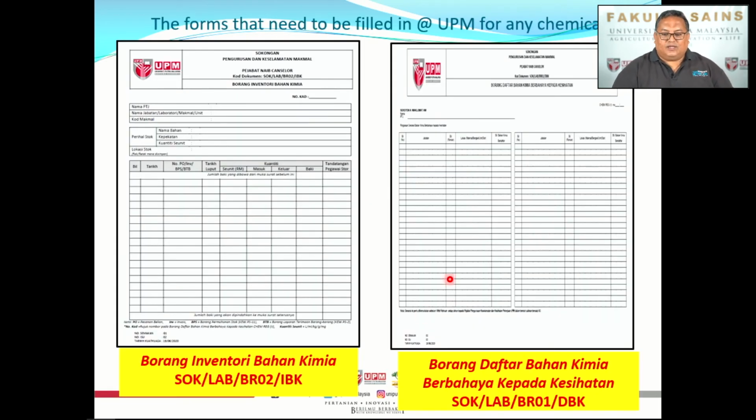These are an example of 2 forms that need to be filled in at UPM for any chemicals. We have one called the Borang Inventory Bahan Kimia, the inventory form for chemicals. And then there's also a form called Borang Daftar Bahan Kimia Berbahaya kepada Kesihatan. So any chemicals that are dangerous to our health must be listed as well. These two forms should be in your lab in a file.